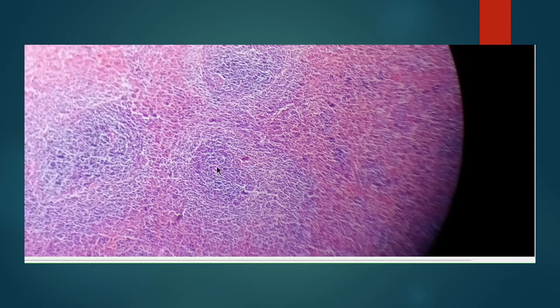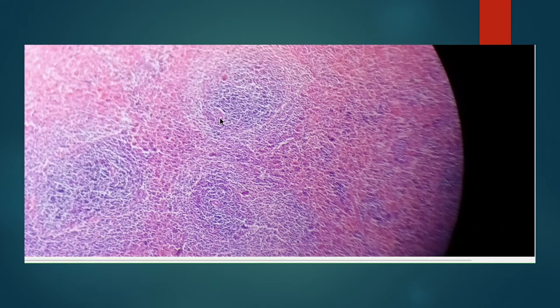Yeah, here you can identify the vessel. So the vessel is nothing but your central artery. But it is eccentrically placed. Here also you can identify. And here it is an artery. So the name is central artery, but it is eccentrically placed.